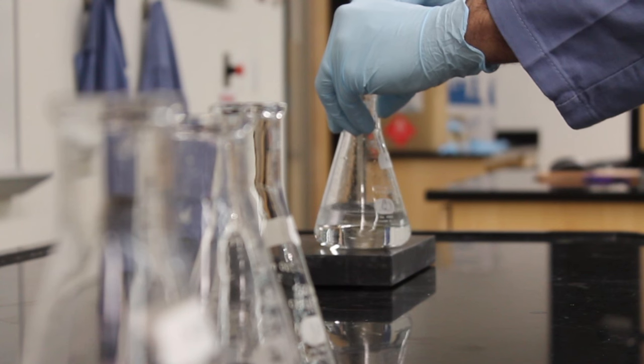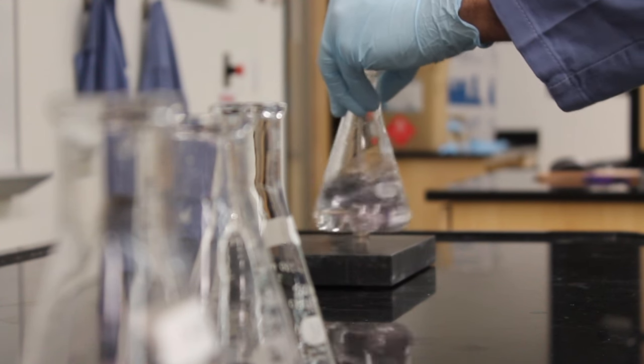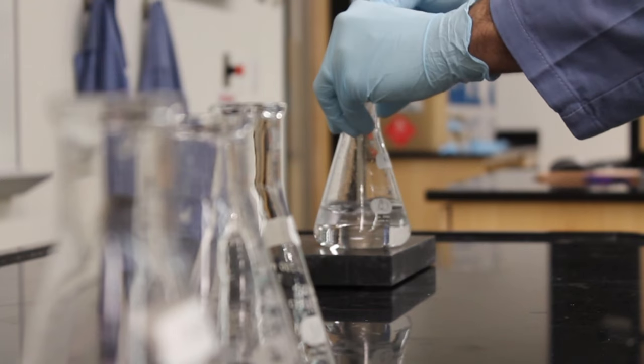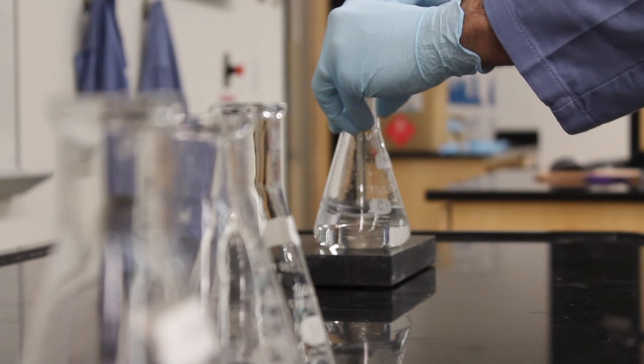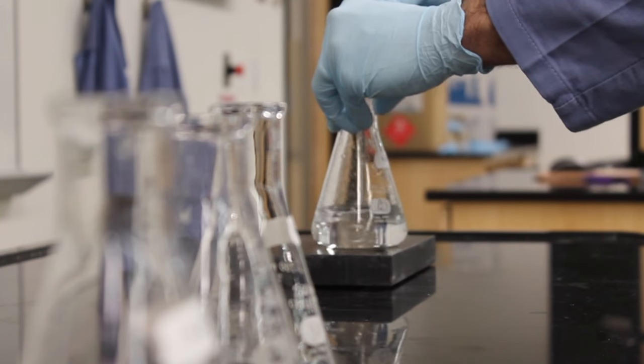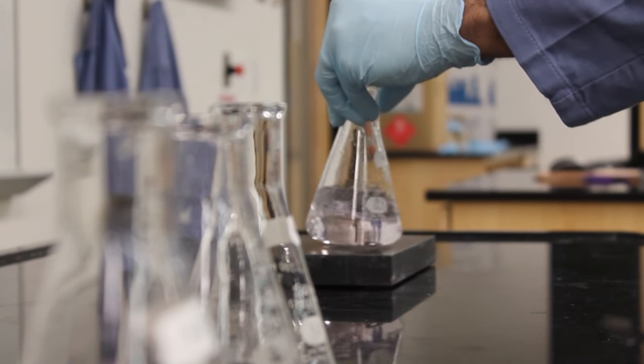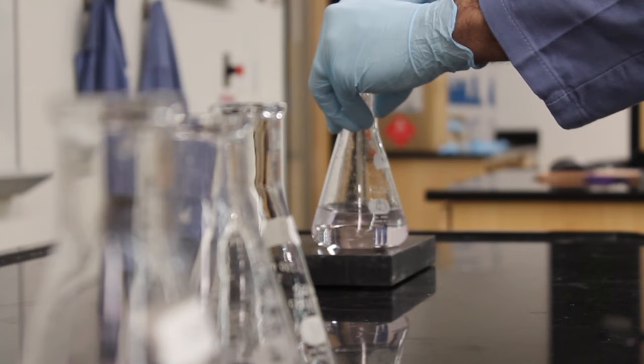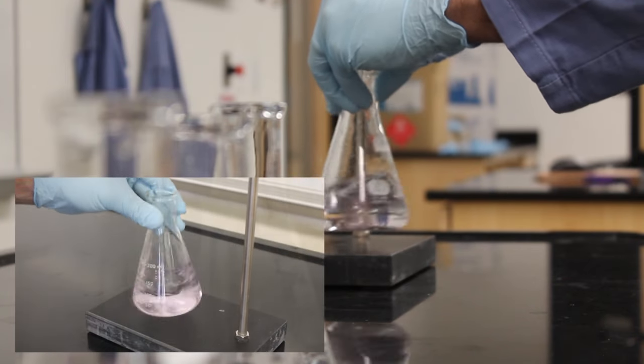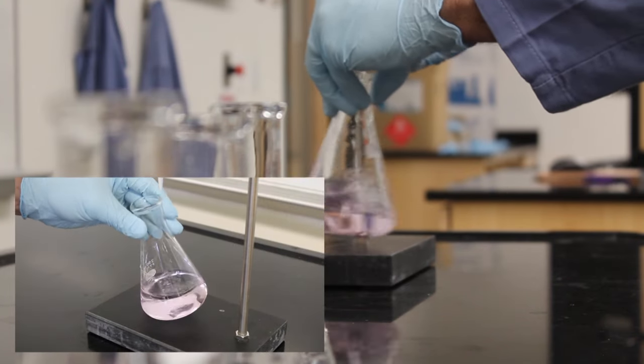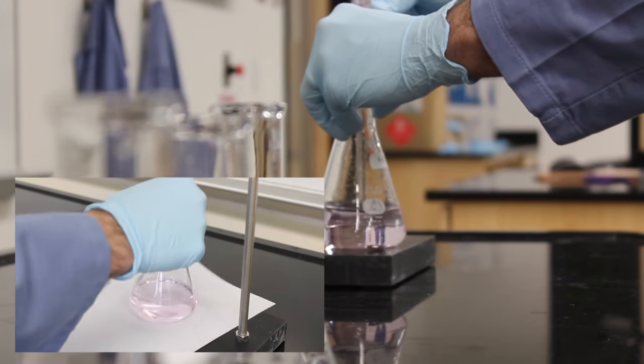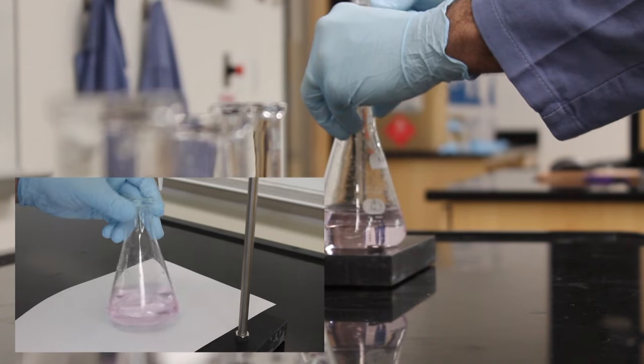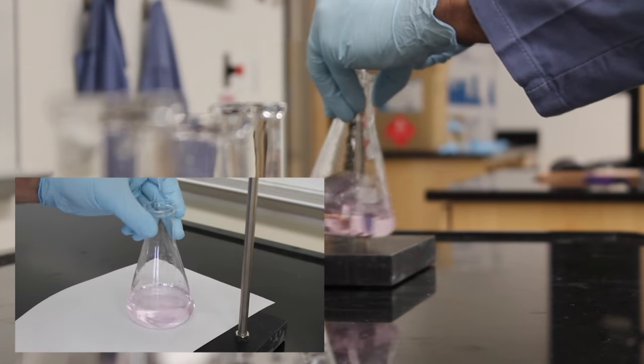This process can take a while, but in order not to go past your equivalence point you need to take your time. Adding your titrant drop wise and stirring intermittently will ensure the best results. Adding a sheet of white paper under the flask can help you see the color change if the black background of the ring stand makes it difficult for you to see. A pale pink is the color that you are aiming for.